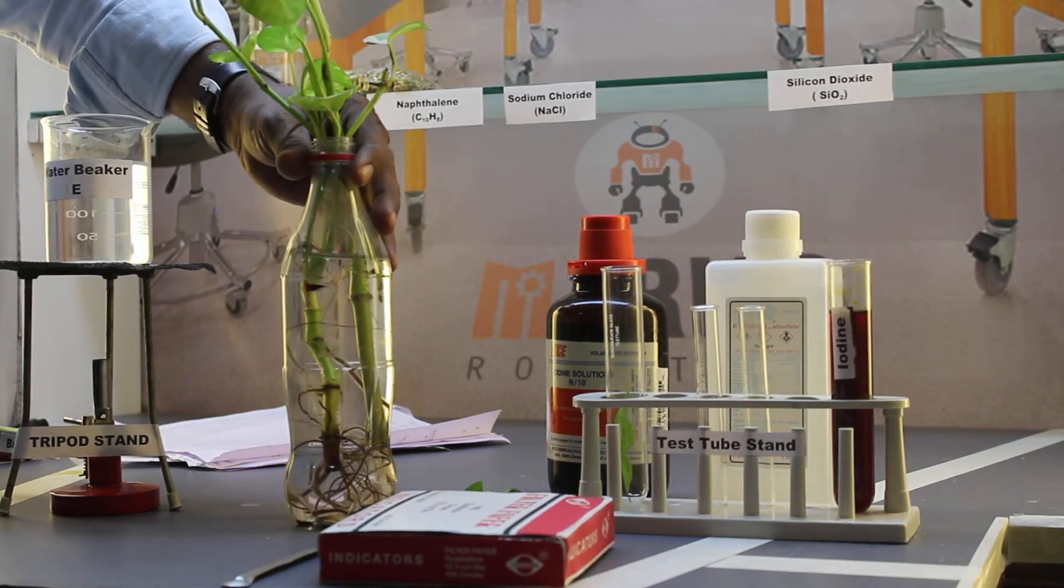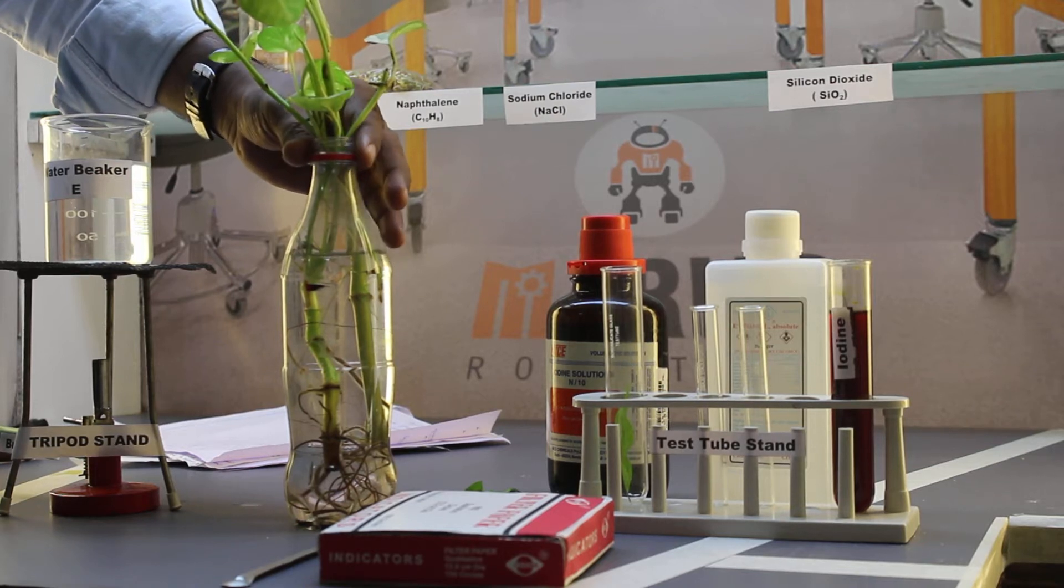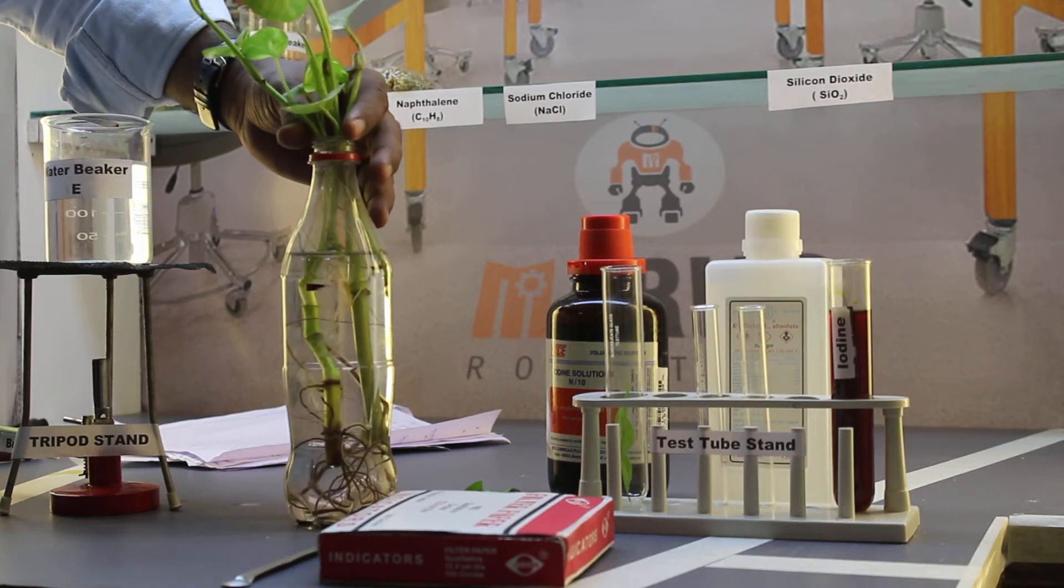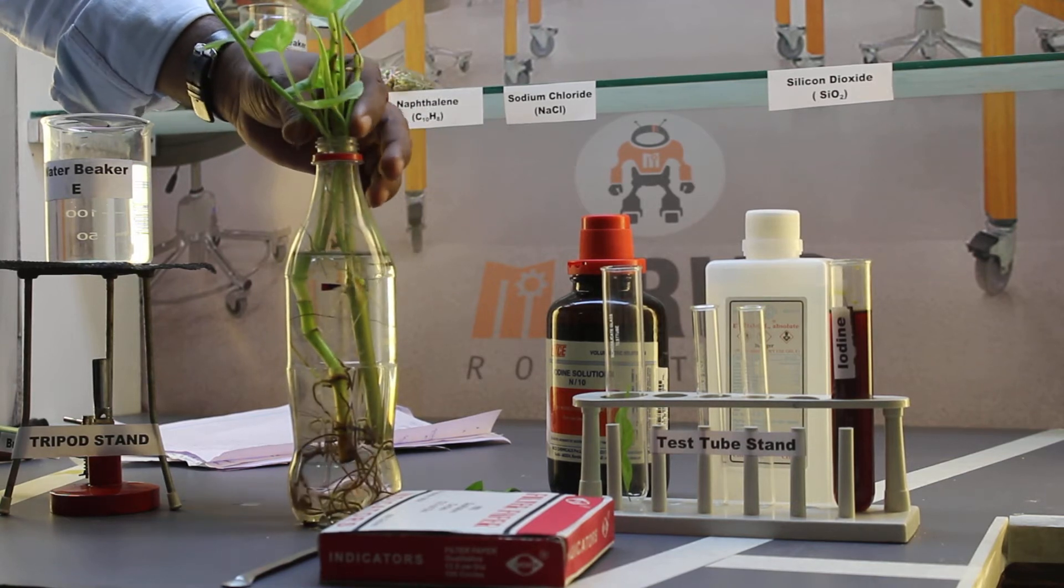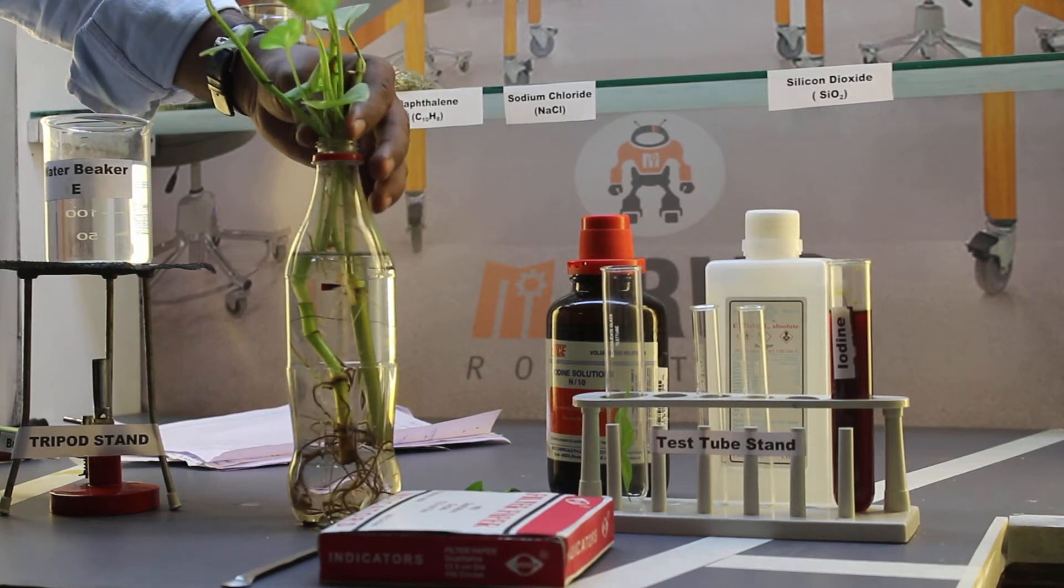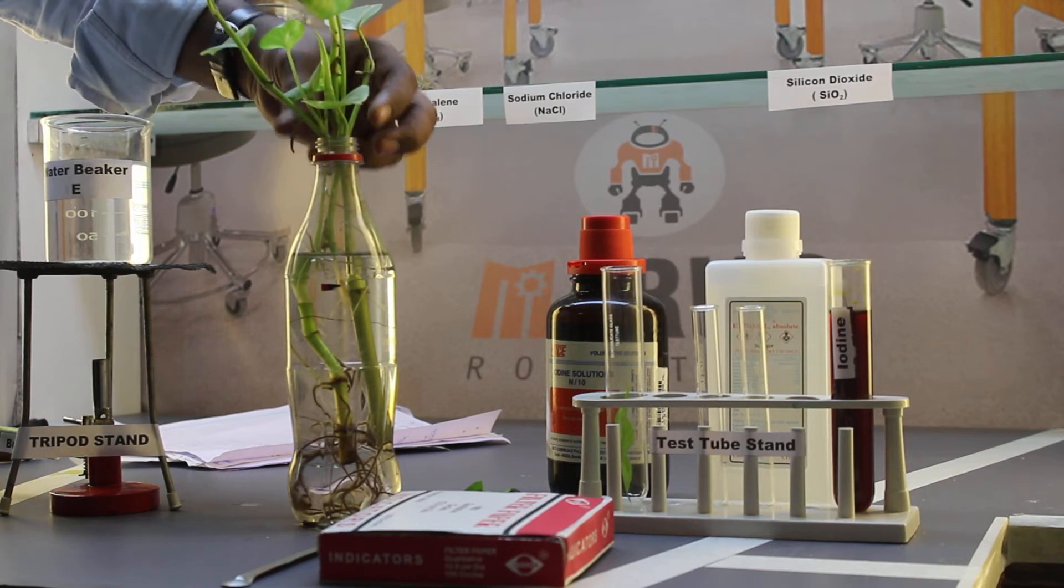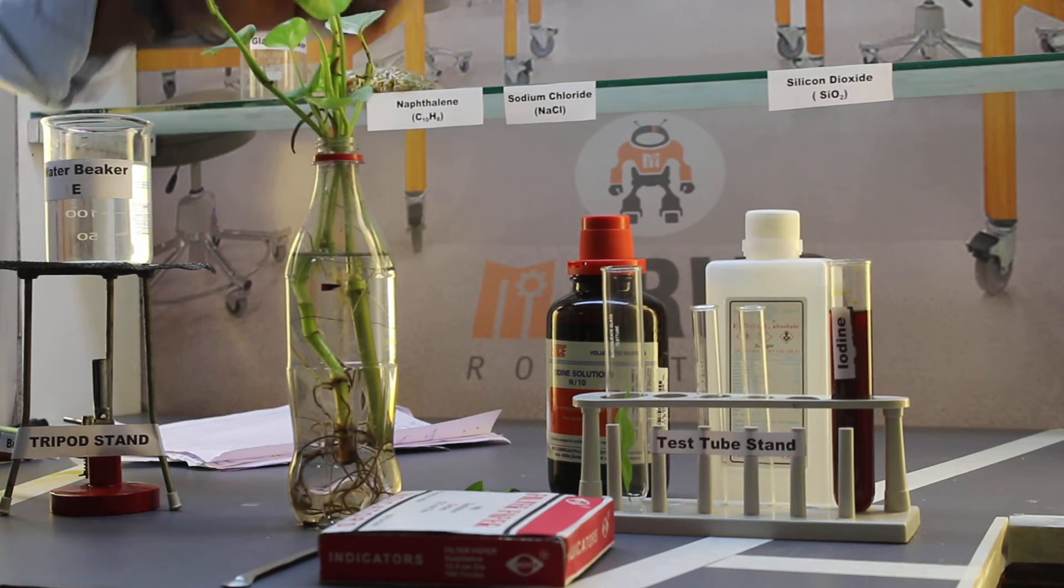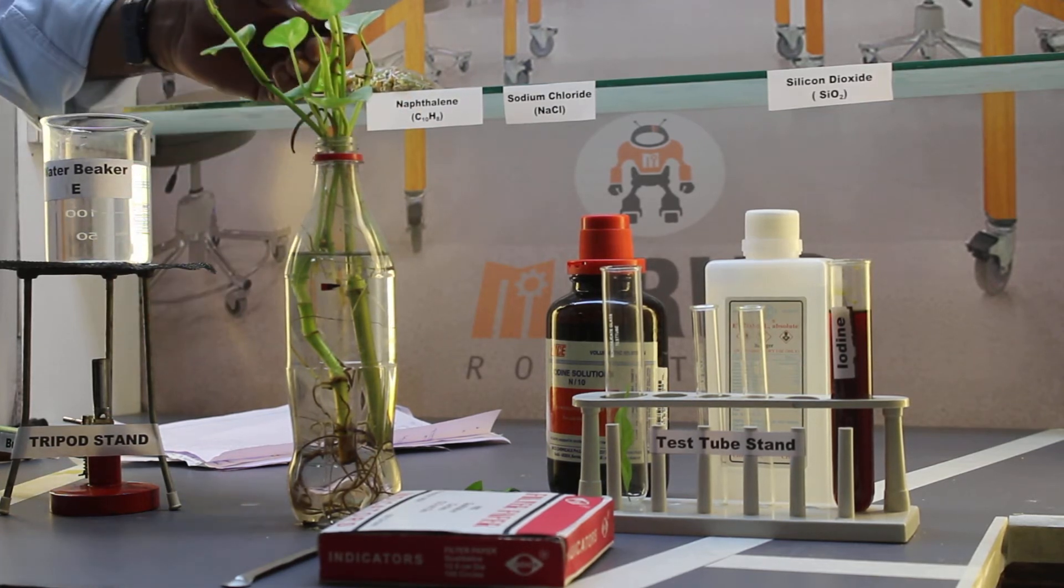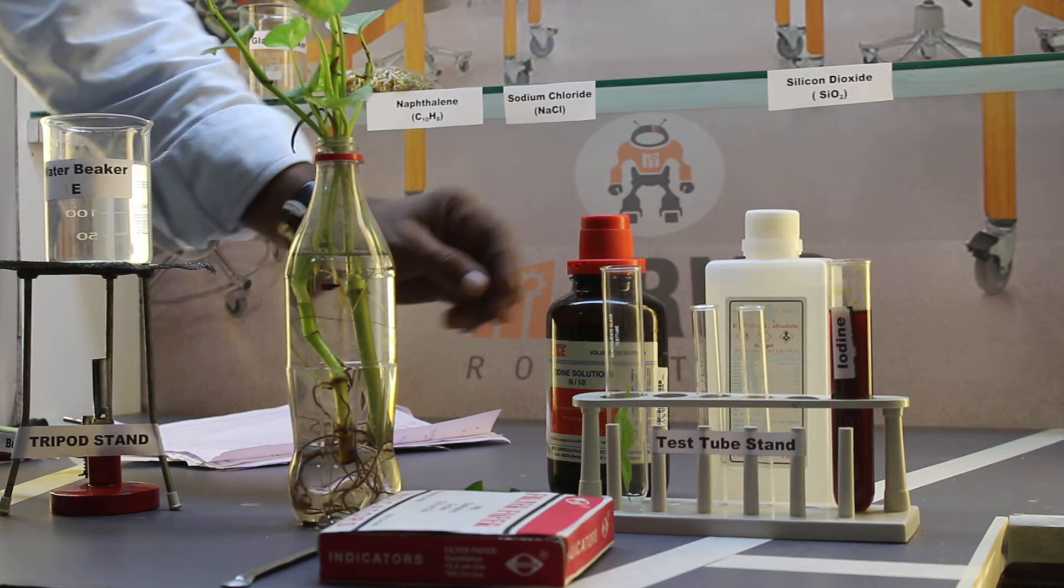Here we have a potted healthy plant. As we all know, all green plants are autotrophic organisms which perform the process of photosynthesis. Autotrophic organisms contain an important organelle called chloroplast which contains a green pigment called chlorophyll, which is involved in the process of photosynthesis.